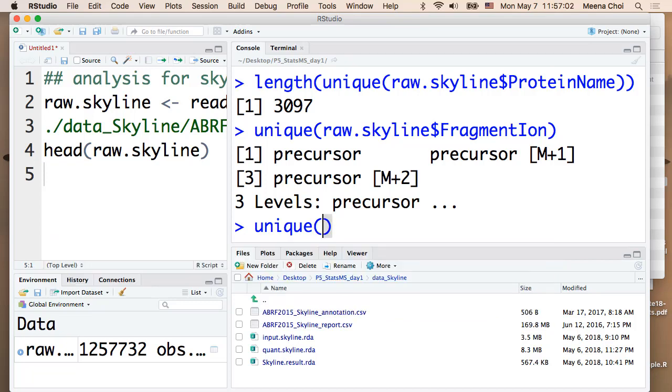This is the data. And this is also the data. No, they don't need it. If they have needed it, just this too.